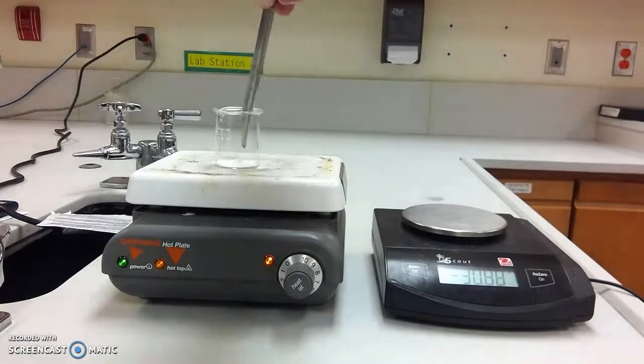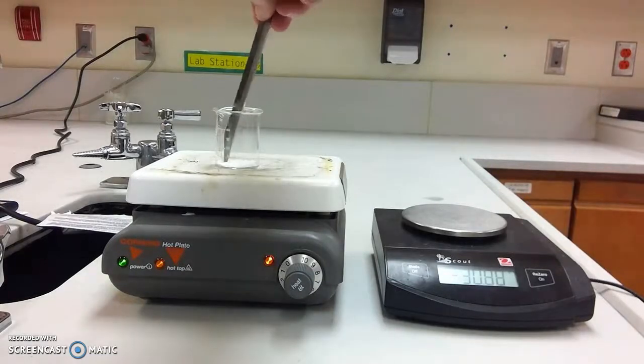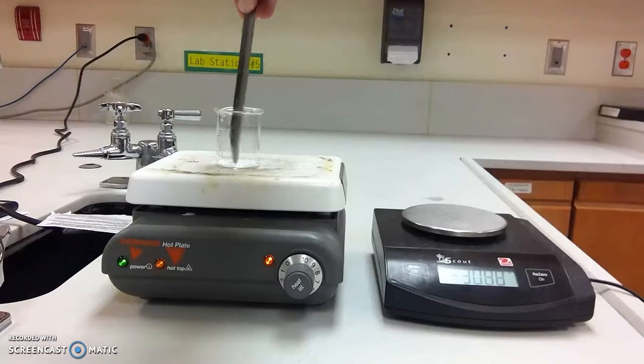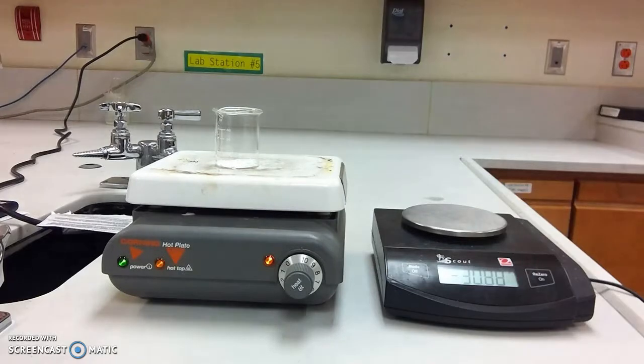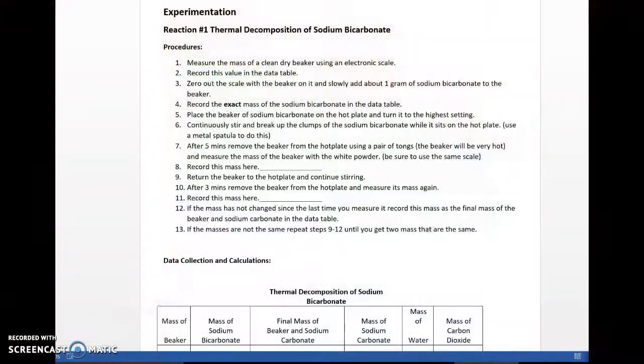Okay, now it's on the beaker. We're using a metal spatula, keep it stirring, keep it moving, break up the clumps, and as it heats up, it's going to begin going through that chemical reaction. We'll go ahead and speed up time real quick here.